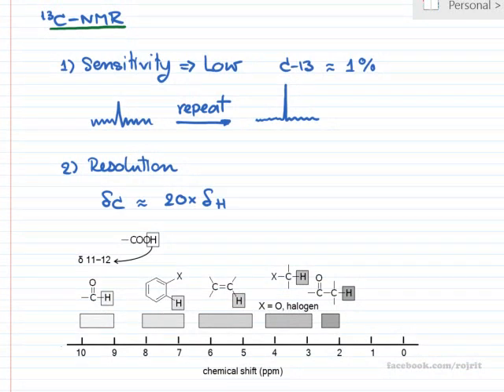So if we let it be coupled, right, then the peak height is decreased by the coupling. For a doublet, the height of the peak is reduced by 50% into a 1:1 ratio, and for a triplet, 1:2:1 ratio, the peak height will be reduced to 25, 50, and 25% of the original, right? So we normally do not let the carbon-13 be coupled with something else. First of all, carbon-13 will not couple with the next carbon. It's different from proton NMR, right?